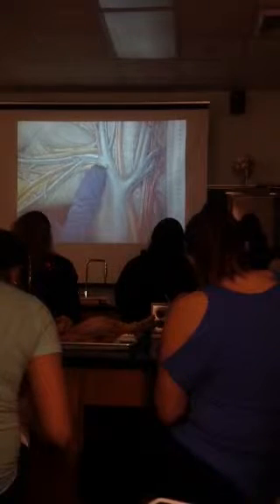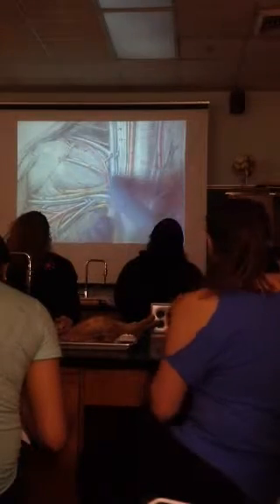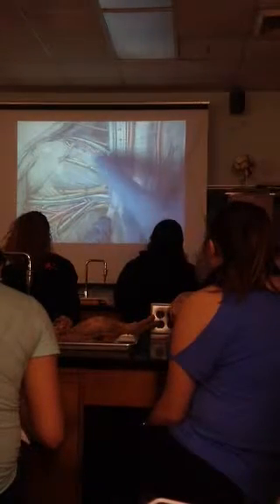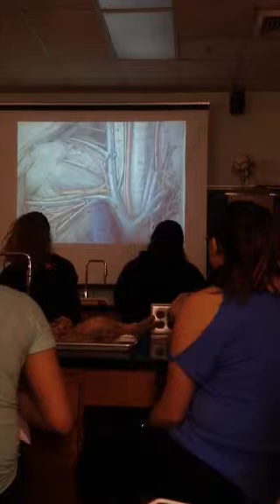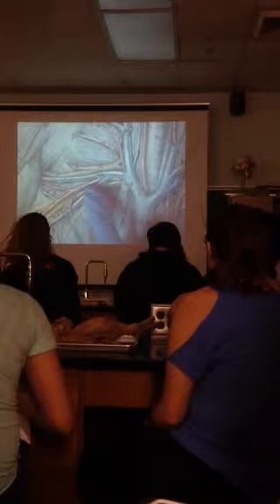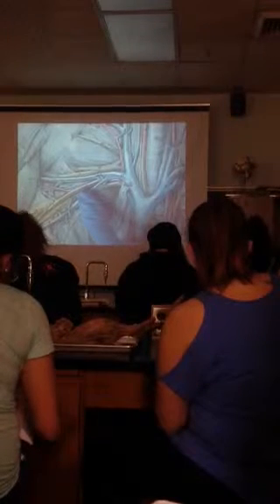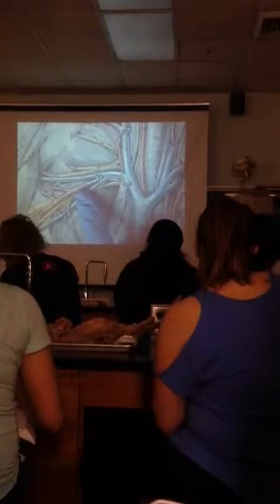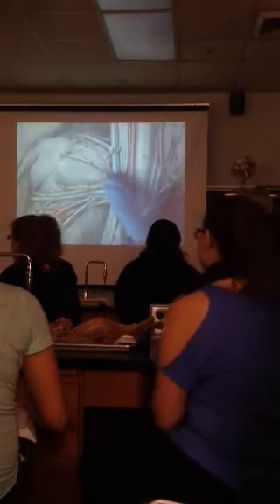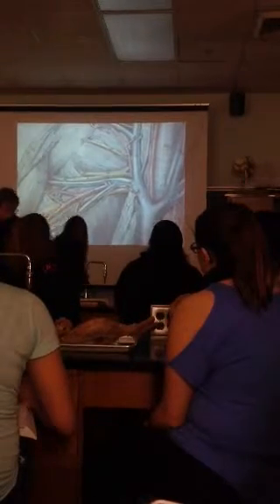Subclavian will turn into axillary, right about the armpit region, but the other way I remember it is when you see this branch going off under the scapula, transverse scapular or subscapular artery, the name changes. So this is all axillary here. Axillary refers to like armpit region, so if that helps you remember it too. This one was transverse scapular way up top, transversing the scapula, and this one is the subway under the scapula. This is subscapular.